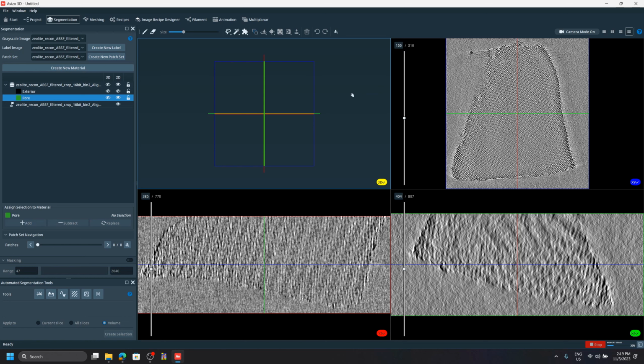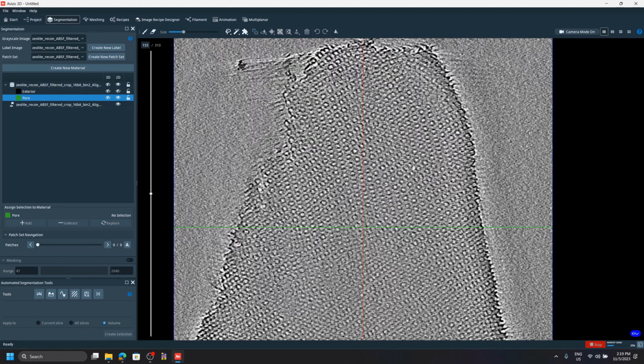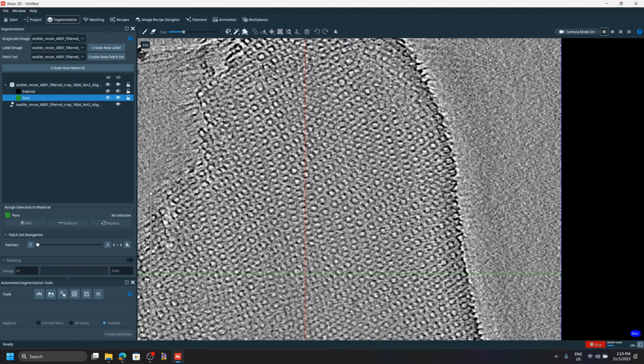And if you remember, the next step is to provide the model with examples. And that's what we're gonna do. So I'm gonna click over here, and I'm just gonna click this one here so we can focus on this window. And I'm gonna select a region.